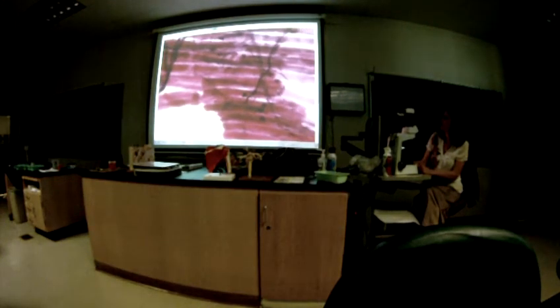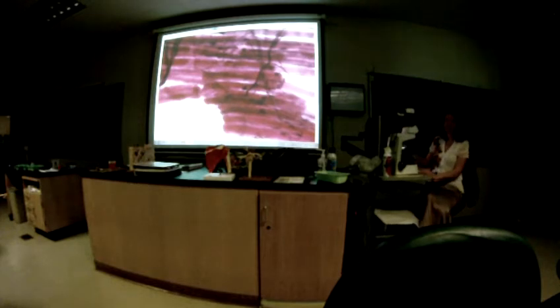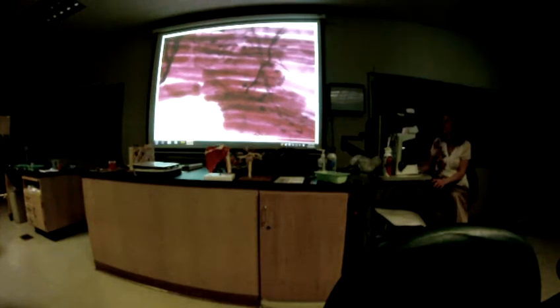Okay, let me show you here, which is poor, and then I'll get that other picture back up. These have the little vesicles in them. There's a couple ways. They're connected to the little stringy things, the telodendrion, and they also have those vesicles in them, the neurotransmitters. What's another word for the bouton? Synaptic terminal, or terminal bouton.